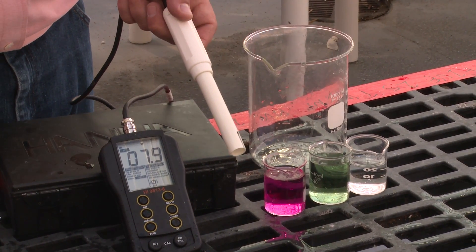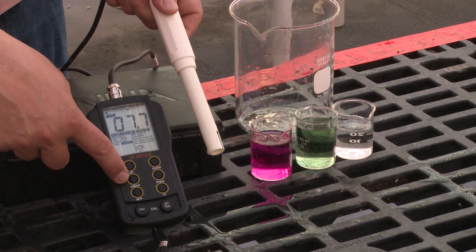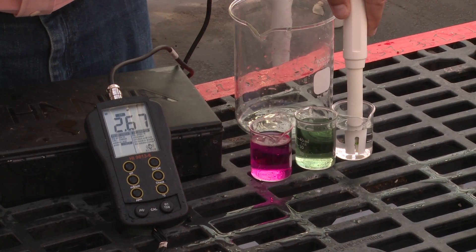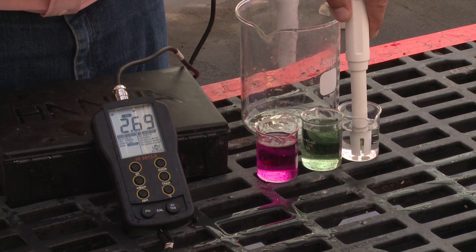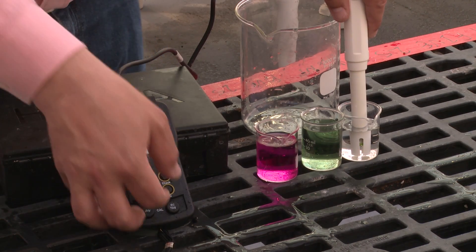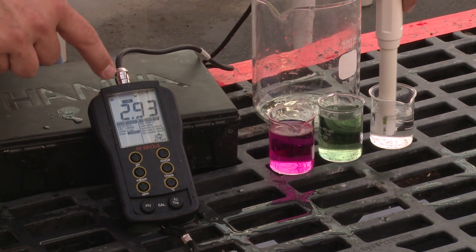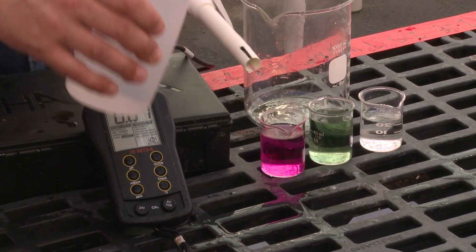Now let's move over to calibrating for electrical conductivity. We want to hit our EC reading in millisiemens per centimeter. We place our probe into our electrical conductivity reference solution. Our EC reference solution has a measurement of 2.93 millisiemens per centimeter. You can see that we've got a reading of 2.7, so we've got to increase our value. Now we use the dial for electrical conductivity. Now that our meter is reading 2.93, the same as our reference solution, we can remove the probe and rinse it off.